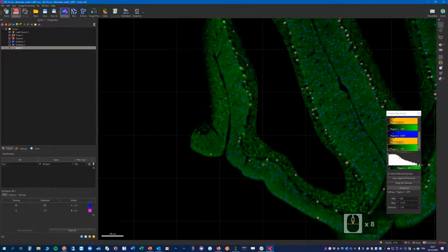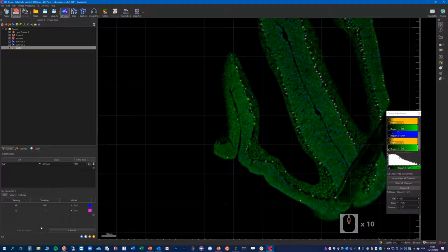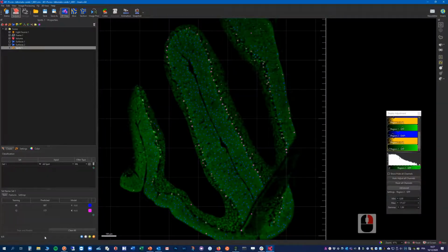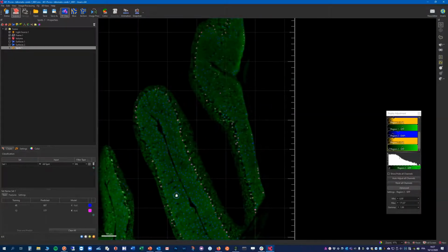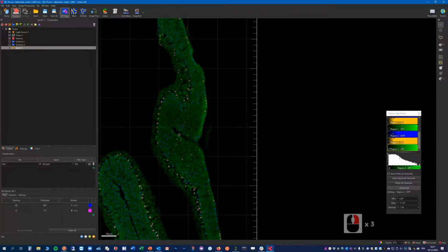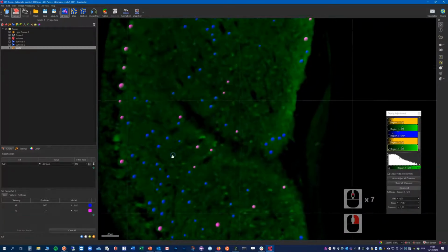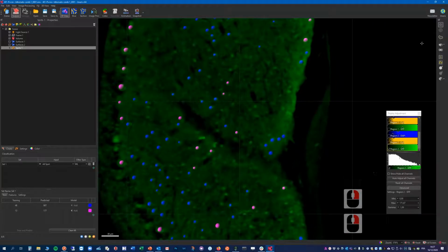So this time, is it done? Yeah. Or is it still doing it? I think it's done. Yeah. So you can see here it's actually worse than before. So let's try to retrain this.